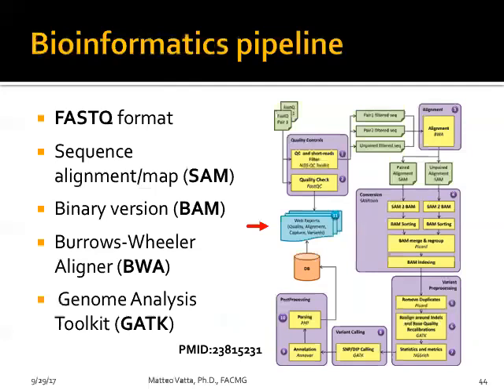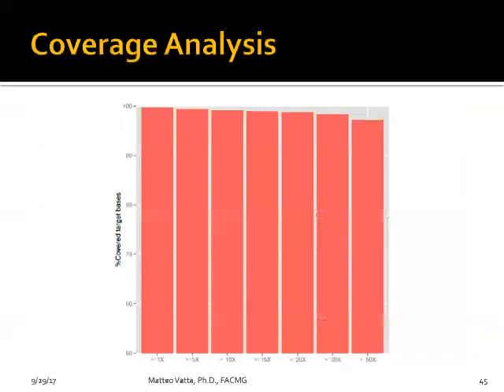So you need to know not only what every fragment that you have sequenced contains in terms of sequence, but also where it maps compared to the reference sequence and all the changes that occur in those fragments that you have sequenced. So one part that is very important, and this is an old slide with the coverage analysis, is to know how many times you have covered a specific nucleotide or a specific target for that matter.